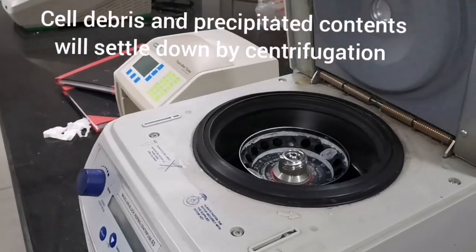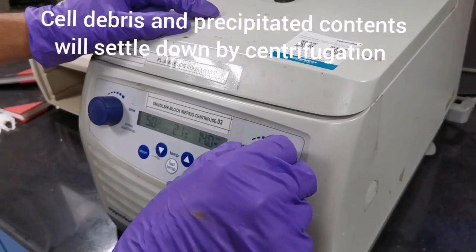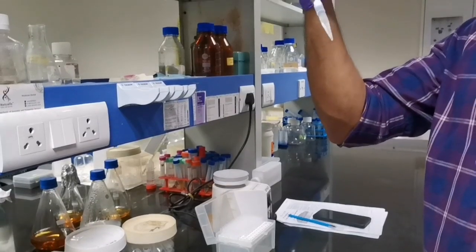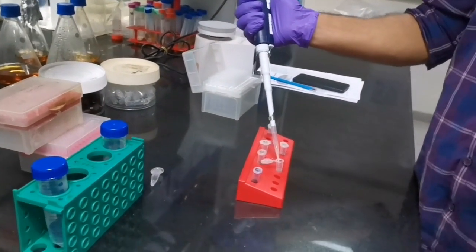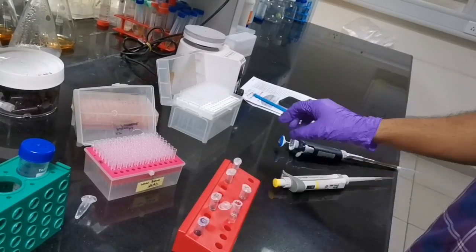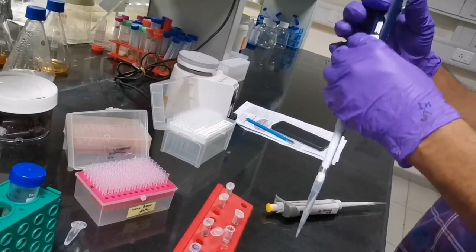I'm doing centrifuge at maximum speed, which is 14,000 rpm for 10 minutes at room temperature. So it's done. I'm transferring the supernatant in a fresh tube, and this is the cell debris pellet. Add the same volume of isopropanol, and we'll keep it at -20 for half an hour.